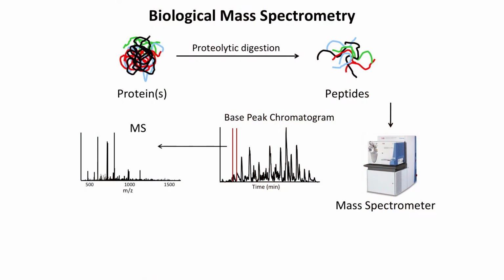And even though we call it mass spectrometry, we're really measuring mass to charge ratio. So something that doesn't carry a charge, in positive electrospray, is very hydrophobic or negative, we won't see it. And if you see a peptide that weighs 1,000 and it has 2 charges, you see it at 500. You can see that this is a single mass spectrum, but you can easily see that there are 100 different peptides present at a given time.